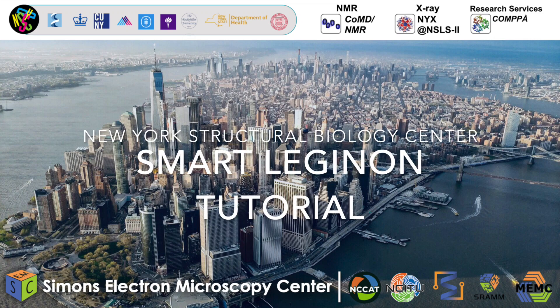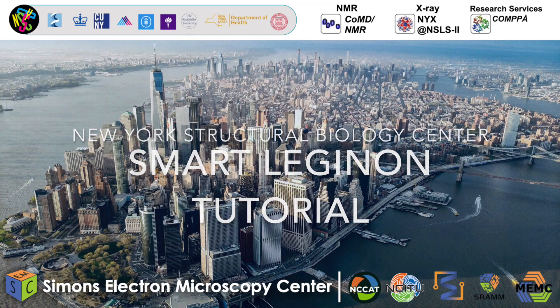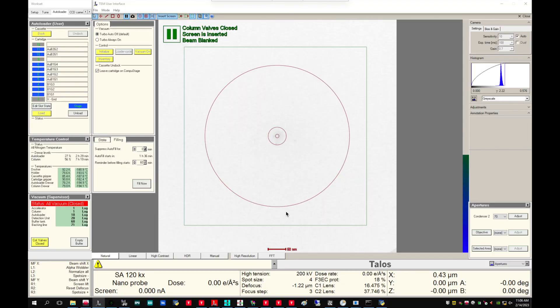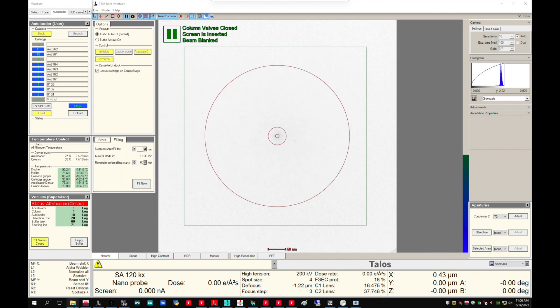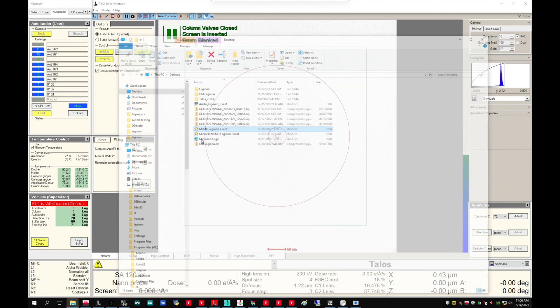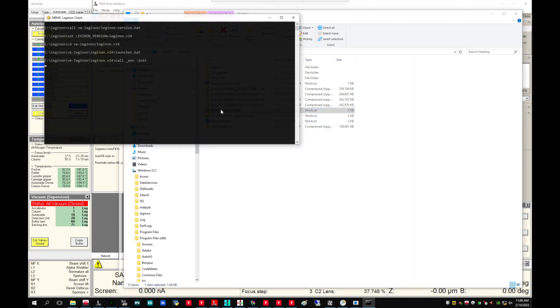Simon's Electron Microscopy Center's Smart Legenon Tutorial. On the microscope PC, if the Legenon client is already open, close it, then go to desktop and reopen the respective client.